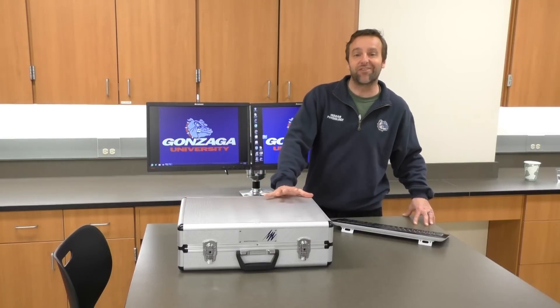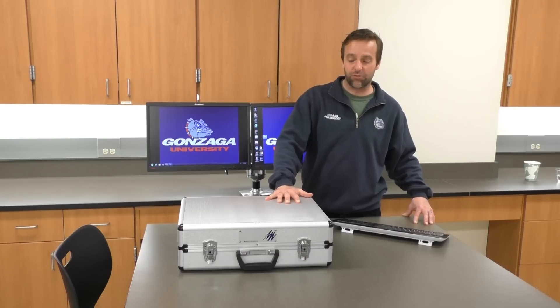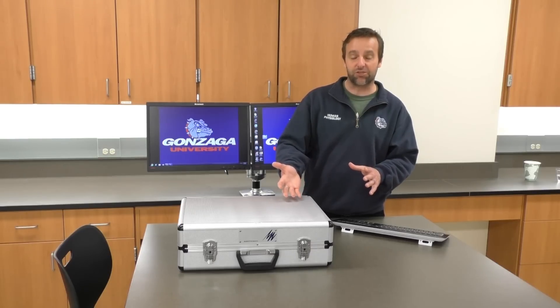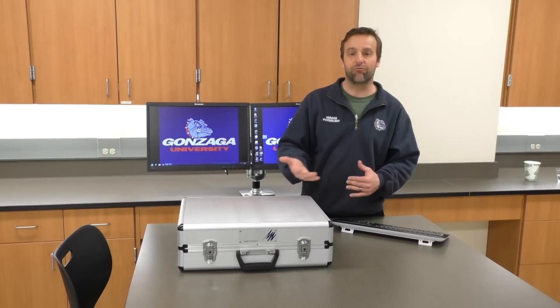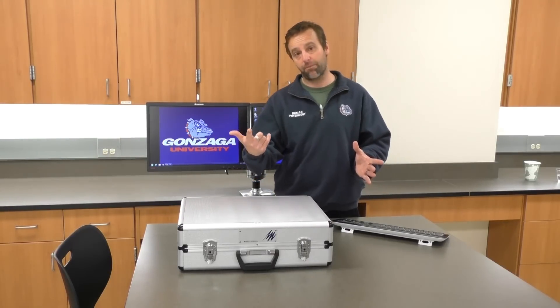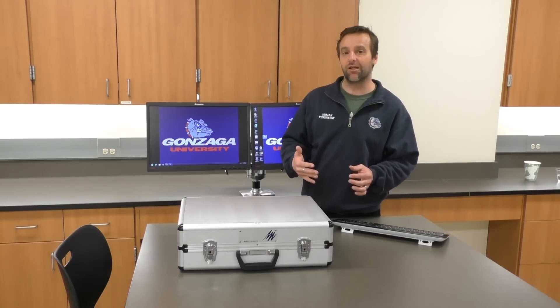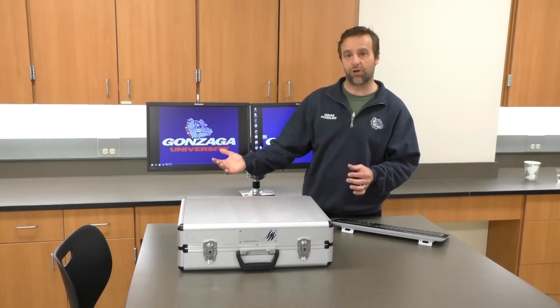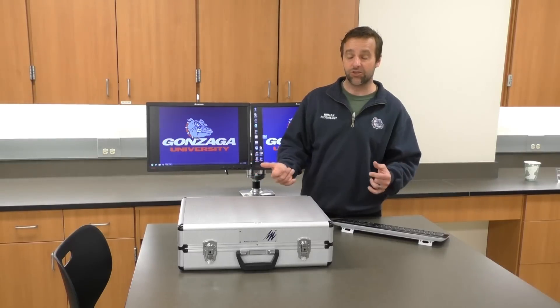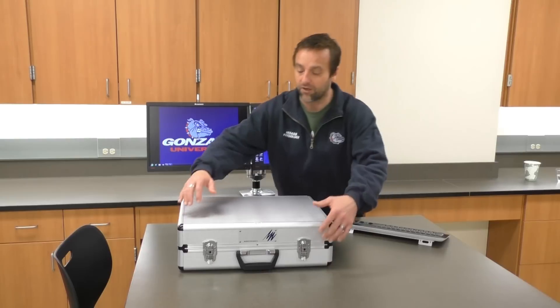Hello, today we're going to go over an introduction of the AD Instruments PowerLab system. This is a basic experiment that we're going to run this week that will introduce you to the capabilities of this system, including how to hook up a subject and do a physiological experiment. Today's experiment is pretty simple — we'll hook up one of my fingers to a pulse transducer and see a representation of my pulse pressure on the screen. This also correlates with heart rate, so we'll be able to calculate average heart rate.